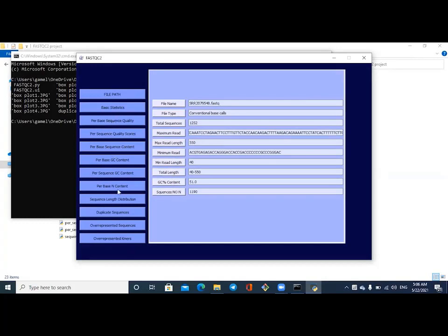Other features are implemented independently of each other. This way, you have full control over the features. You can do analysis by executing exactly one feature, two features, or any number of features that you want. And this way, you can do analysis on different files at the same time. In this video, I will try to execute all these features on only one file.